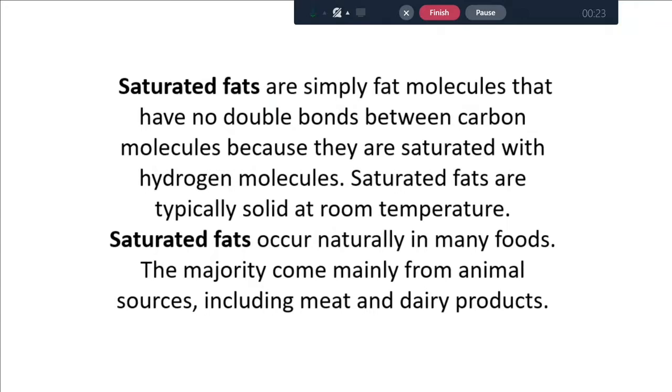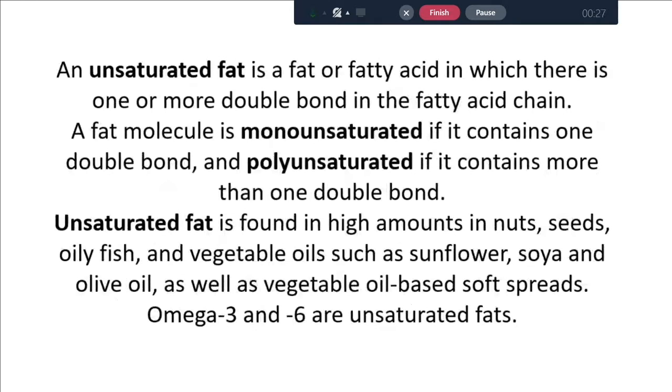As can be seen from the picture, popcorn doesn't contain much fat because there is no red stained oil floating on the water surface, but if it does, most of the fat is likely to come from the butter in the popcorn. Unsaturated fat is a fat that has one or more double bonds in the fatty acid chain.